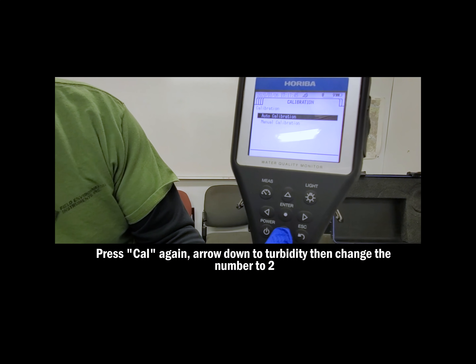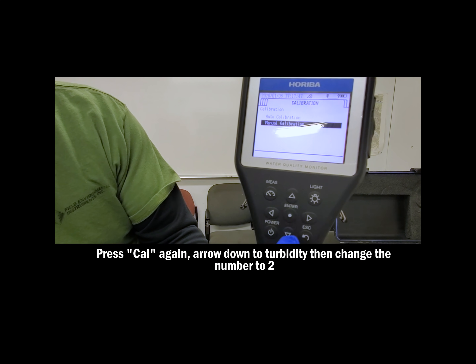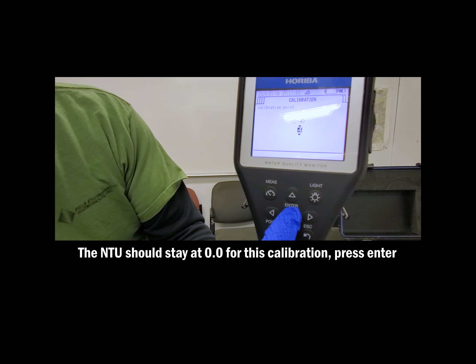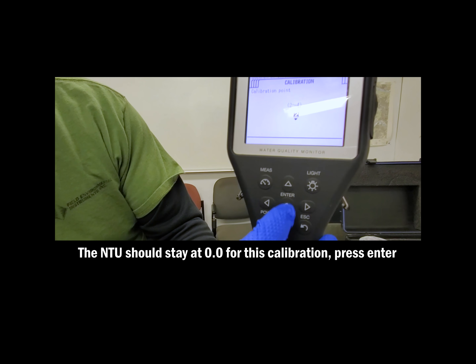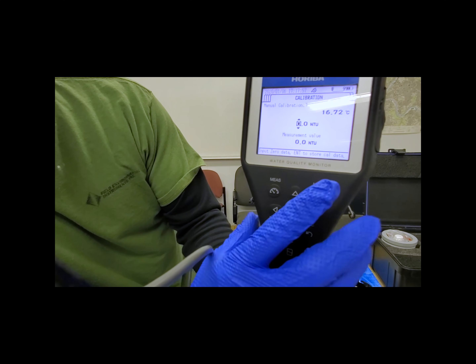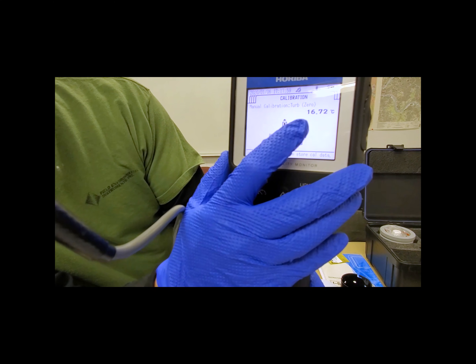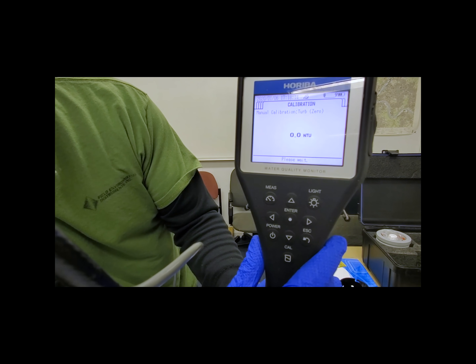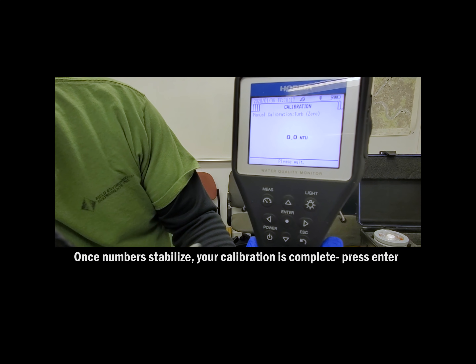Before dumping out your solution, we'll have to calibrate the 0.0 NTU turbidity value. To do this, press CAL, go down to Manual Calibration, move to turbidity, use two points, and set the value as 0.0 NTU. Once the number is stabilized and your calibration is complete, press ENTER, and go ahead and dump out that auto-cal solution.